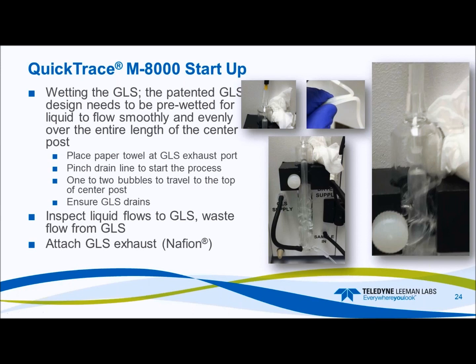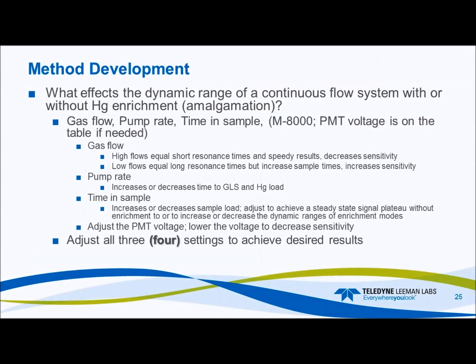Release the drain line, allow it to drain out, inspect your flows to the GLS, and then from the GLS, you attach your GLS exhaust, which is actually to the Nafion, and then you're ready to roll. So now let's get into the method development.